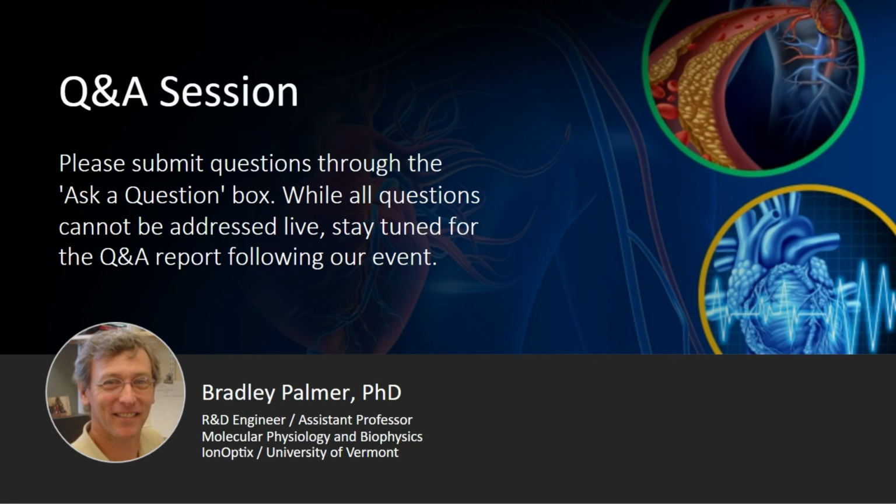In fact, we've performed those kinds of studies where you will reduce oxygen availability or reduce glucose availability, reduce also the withdrawal of byproducts. And so the tissue does become ischemic right there on the experimental apparatus. And it will also recover from ischemia too. That is, you can simulate ischemic reperfusion injury using this model system quite well. That's incredible. It's interesting.